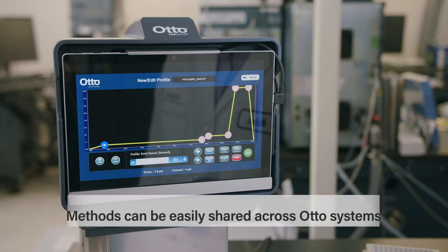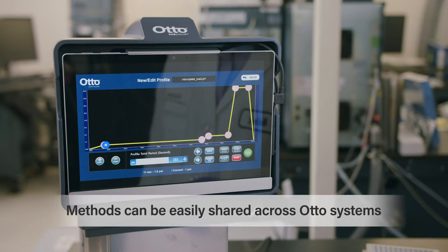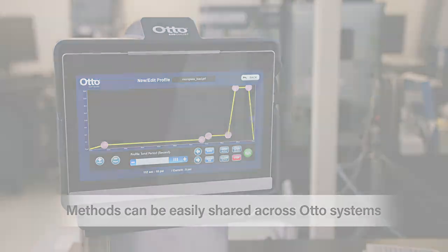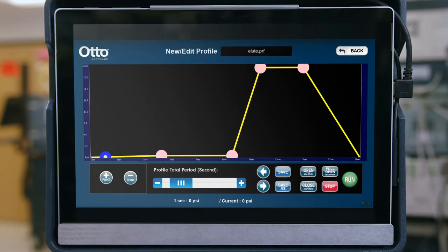These methods can be used across users and easily shared between automated systems. Because the exact processing parameters are recorded in the software, it also makes duplication to other automated systems easier than ever.